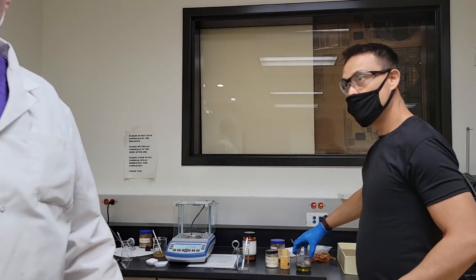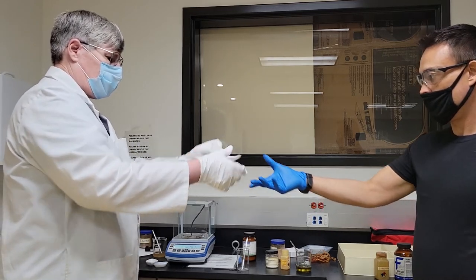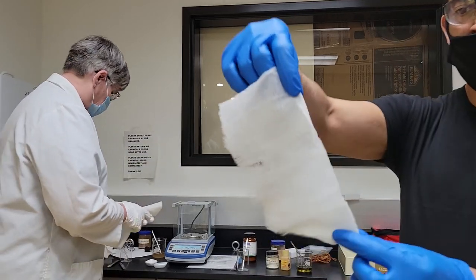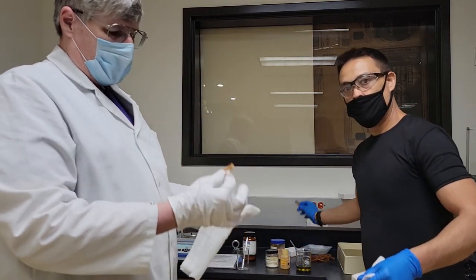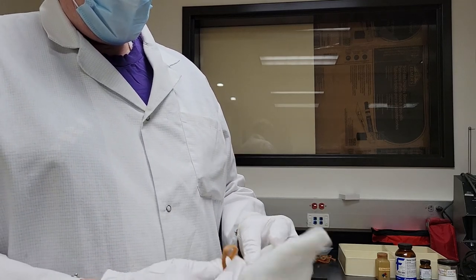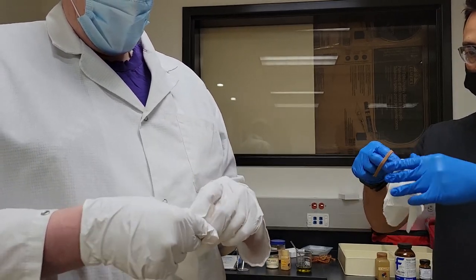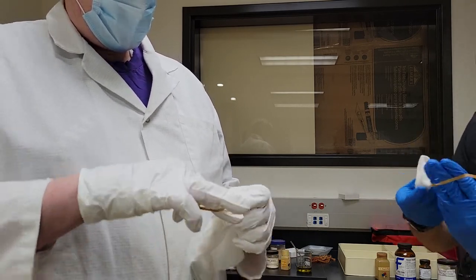What we're going to do now is tie up our tie-dye cloth any way we want. I'll give Professor Amor his swatch of cheesecloth. You can use cheesecloth for filtering as well — it's just from the grocery store. So when you tie-dye, you're basically going to wrap rubber bands over sections of it randomly. You can fold it to try to create repeating patterns, or you can just make it random. I've already folded this in half once, and then you just make it really tight. Everywhere you put on the rubber band tightly will not have a chance for the chemicals to affix and change that part of the cheesecloth.